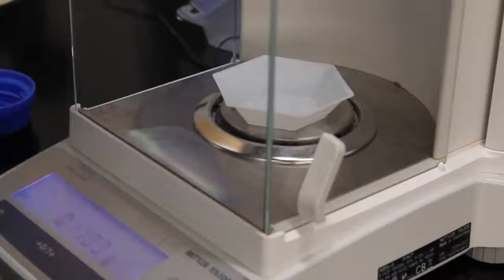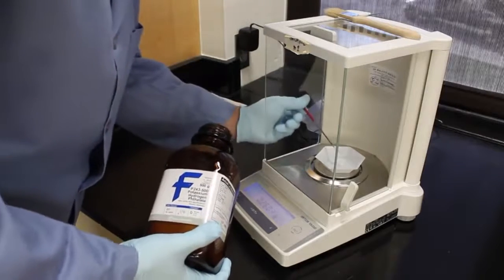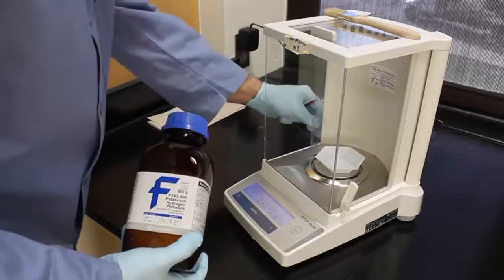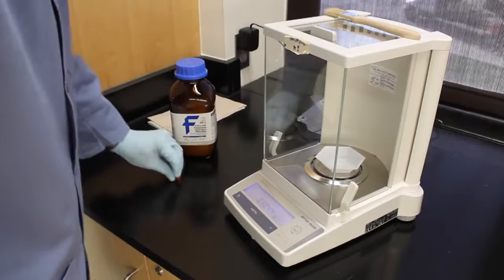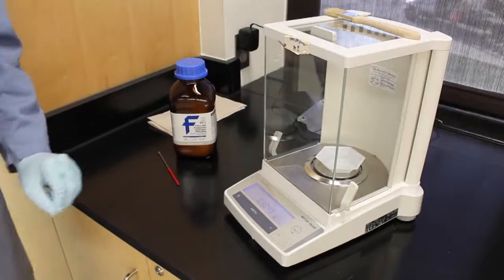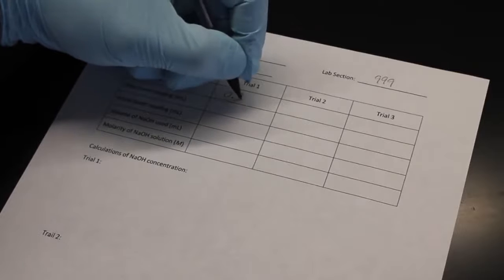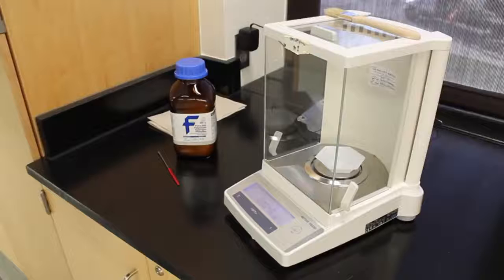Any excess KHP should not be put back into the bottle, but disposed of properly. Ask your TA for specific instructions. If you are using this style of balance, make sure to slide the door closed to get your final mass. You will need to document your KHP masses each time you take one. I recommend you weigh out 4 separate boats of KHP for your titrations, but really it's up to you how many you do.